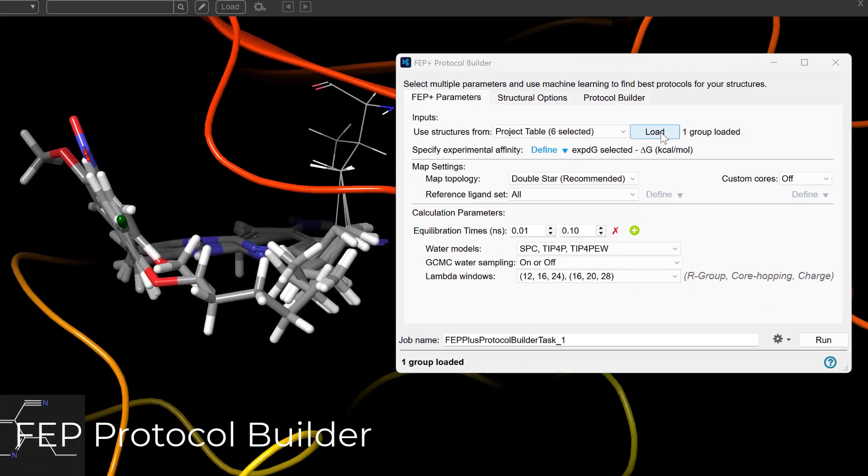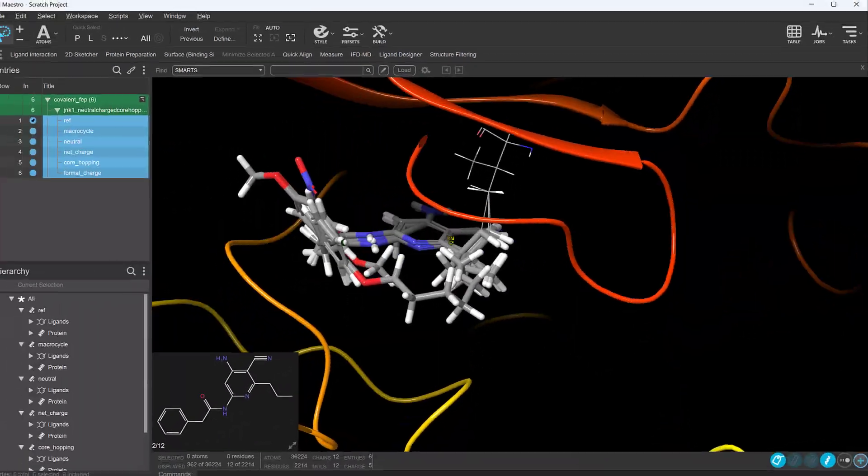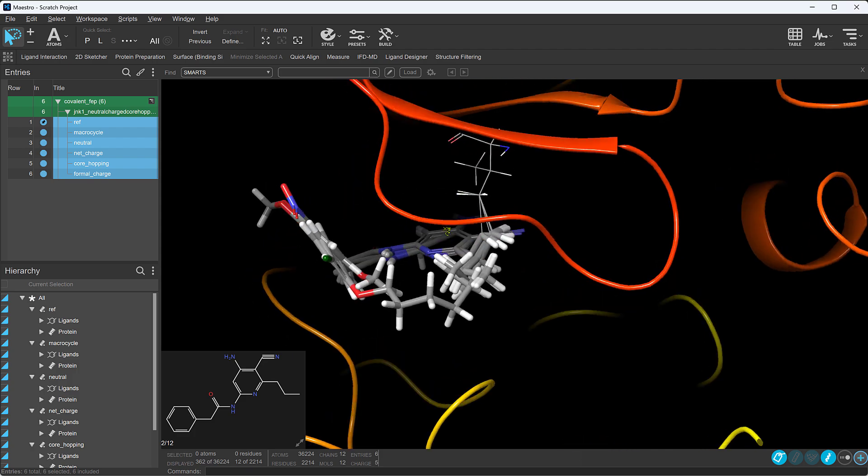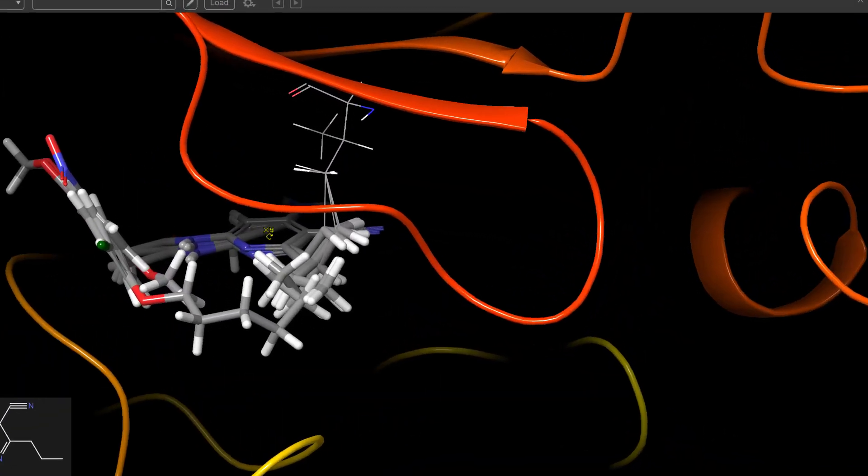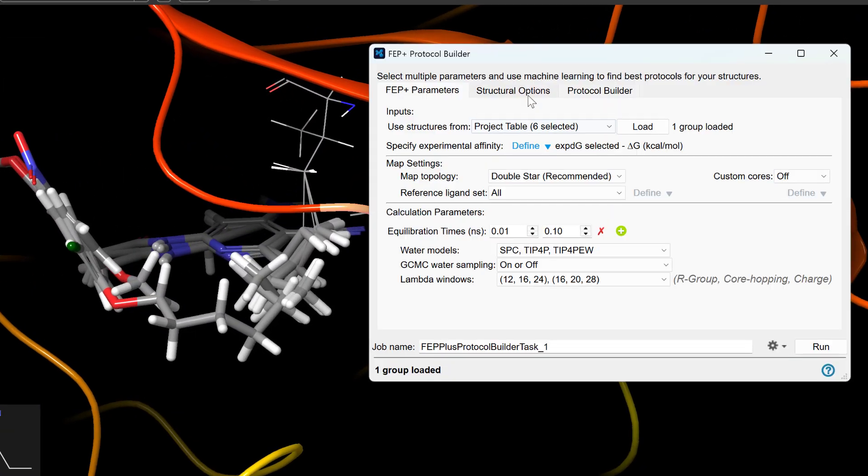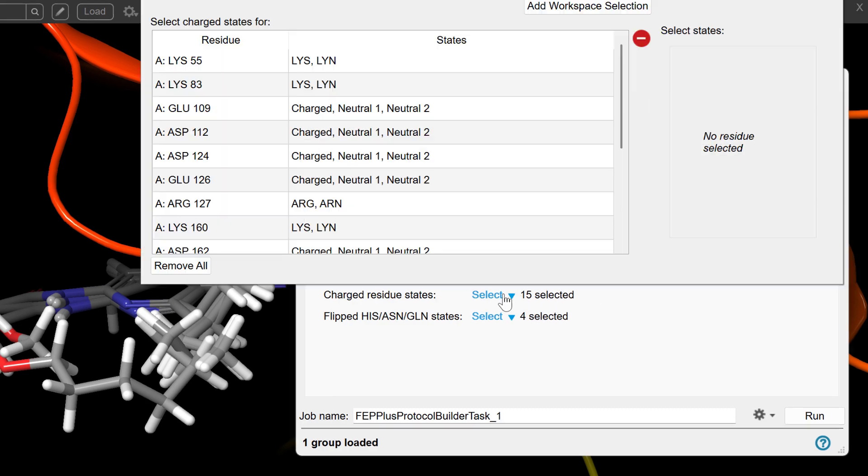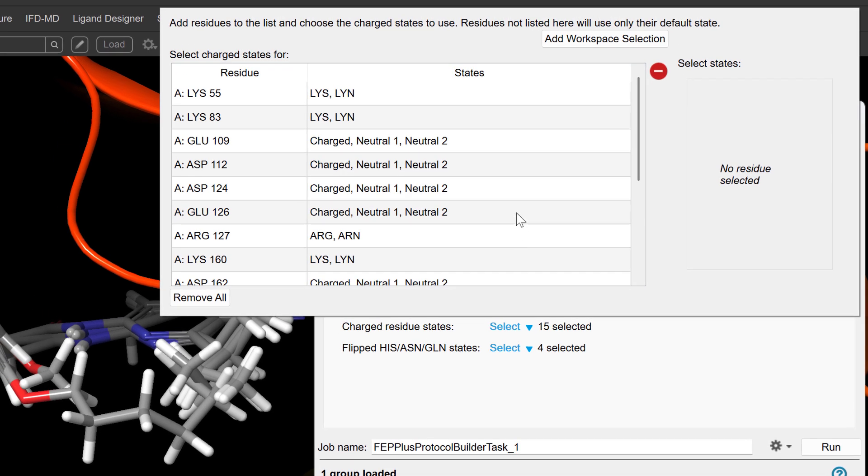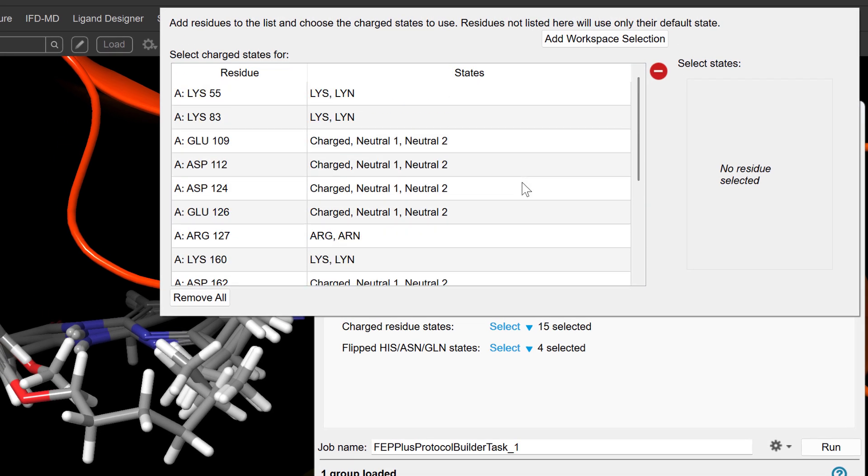The FEP protocol builder is also enhanced. It now supports covalently bound ligands as input, and offers a new option in Structural Options to sample varying charge states of binding site residues.